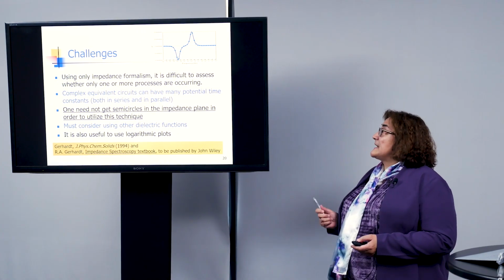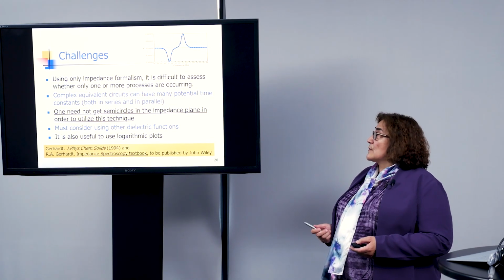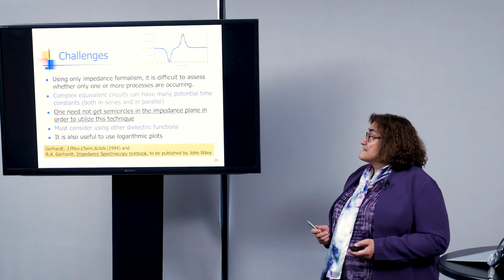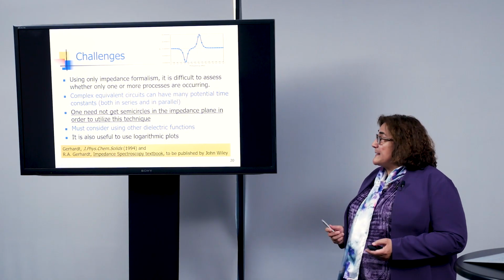interpreting the same data. So what are the challenges? Well, using only the impedance formalism, it is difficult to assess whether only one or more processes are occurring. The complex equivalent circuits can have many potential time constants, both in series and in parallel.